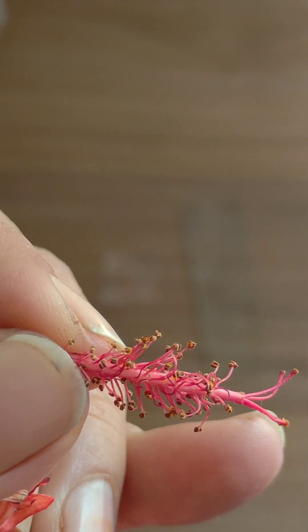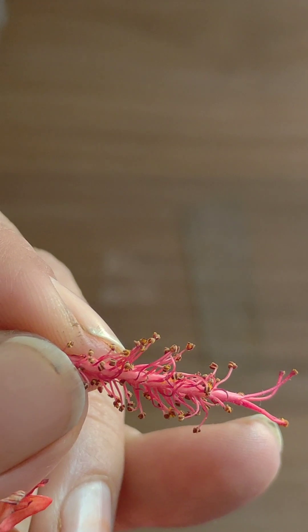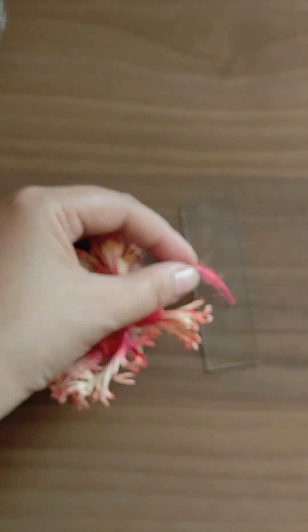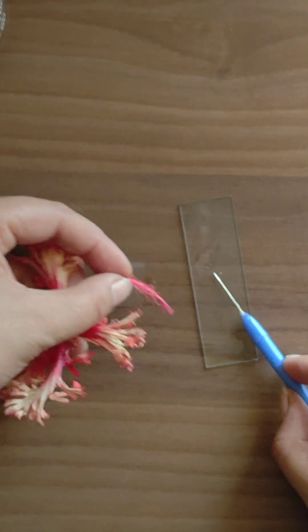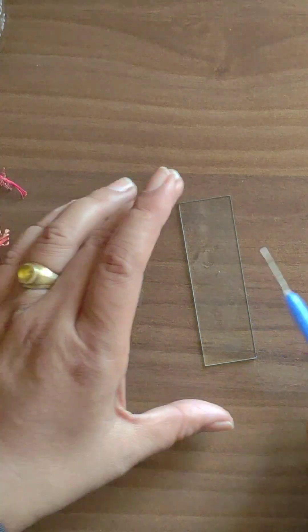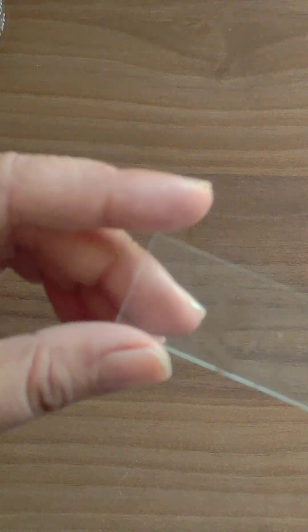You have to remove it very carefully and place it on the slide. With the help of needle, you can remove it. See, this is the pollen grains.